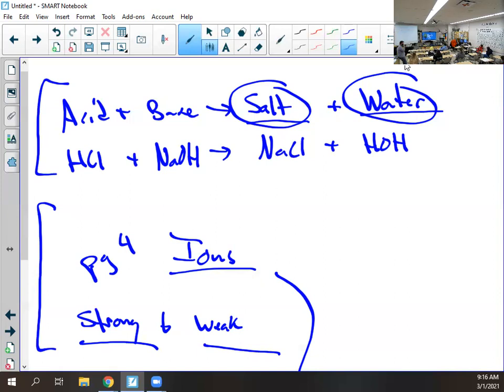Today we're not doing safety glasses. Well, they're all household products. Will you be careful? Okay, I won't make you wear safety glasses or aprons, but they are household things. There is bleach, so just be careful so you don't bleach your clothes or anything like that. When you're done, rinse it out.